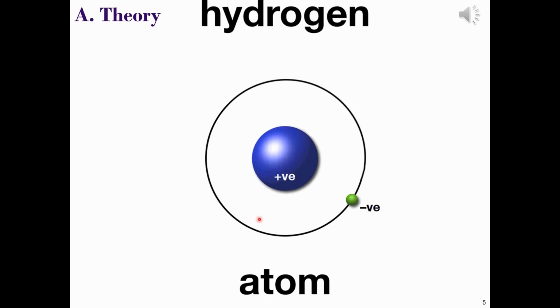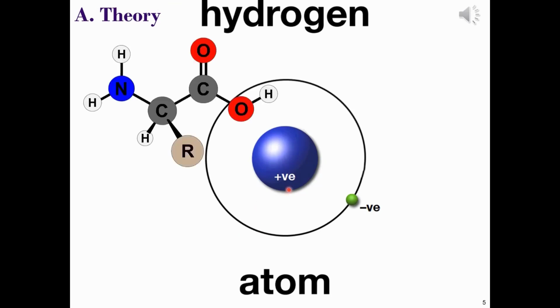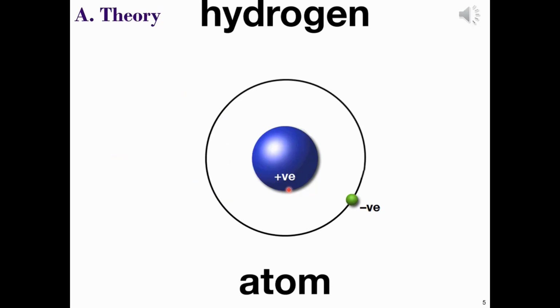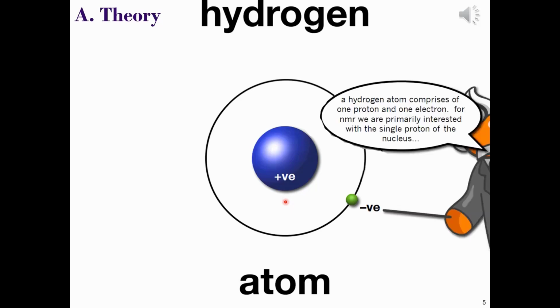Hydrogen atoms are an integral part of an organic molecule and can feature in the simplest amino acid monomer right through to really complicated protein structures, such as that of an enzyme. Being able to tell the environment of the hydrogen atom and what it is connected to is part of a biologist or chemist toolkit in structural elucidation. However, in order for NMR to work, it relies on atoms being comprised of an odd number of protons and neutrons, otherwise their spin cancels.